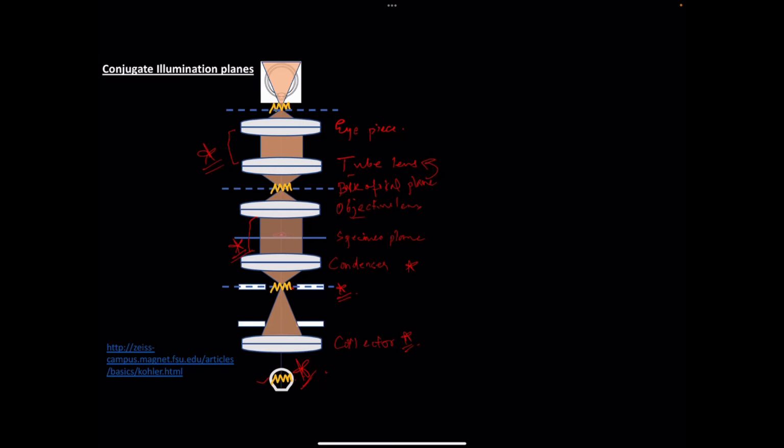After that, an eyepiece is going to converge and focus the light which is coming in the form of a collimated beam to a particular point, from where this image is going to be produced again on your retina. However, the image of the filament is only going to be produced by the eyepiece around 1 centimeter away from your eye.